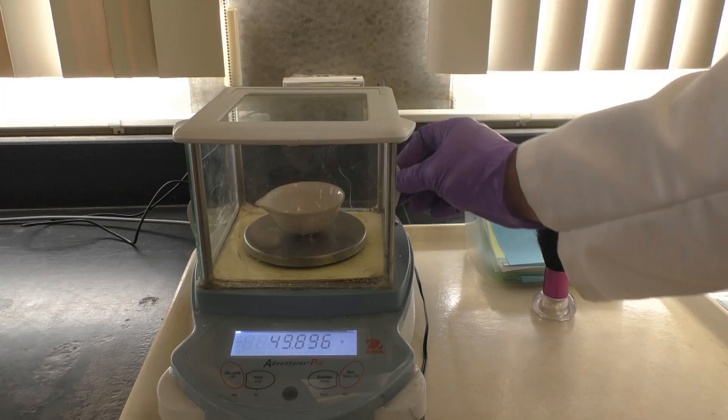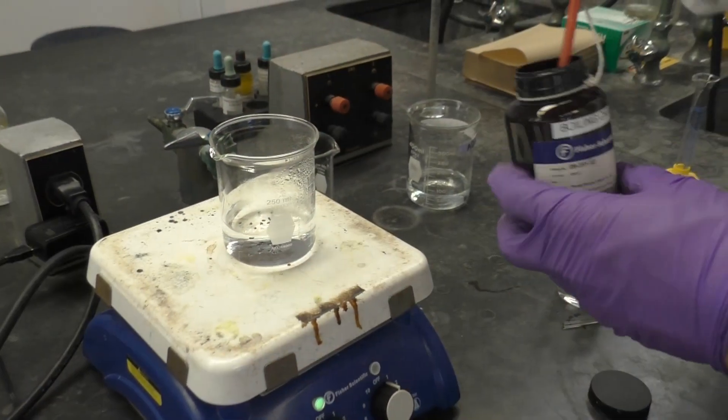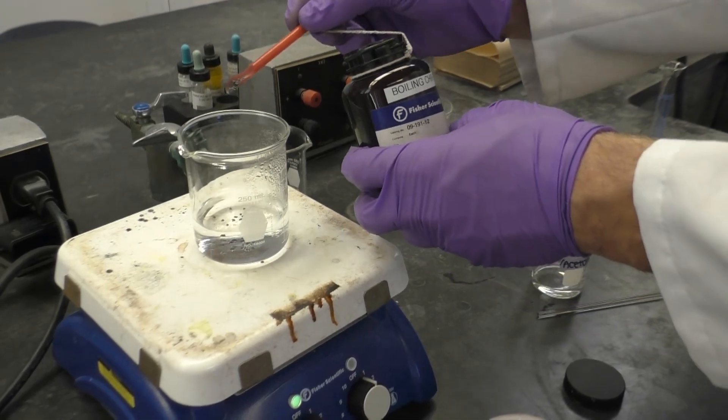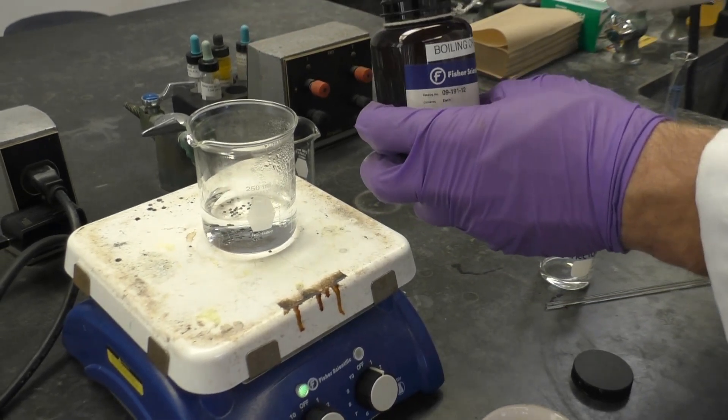While you're waiting for your evaporating dish to cool, obtain a 250 milliliter beaker, put a few boiling chips in it, and then begin heating about 100 milliliters of water for a steam bath to dry your copper.